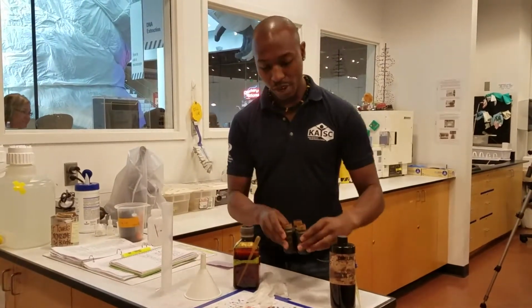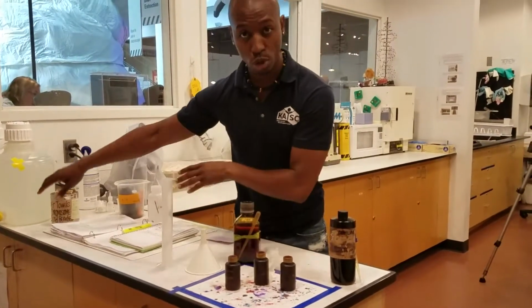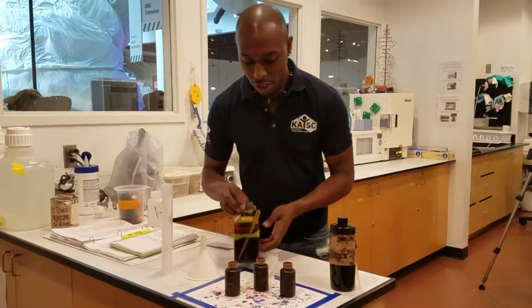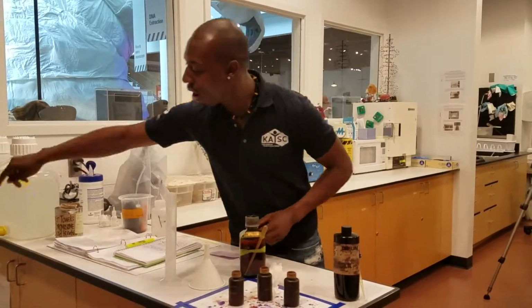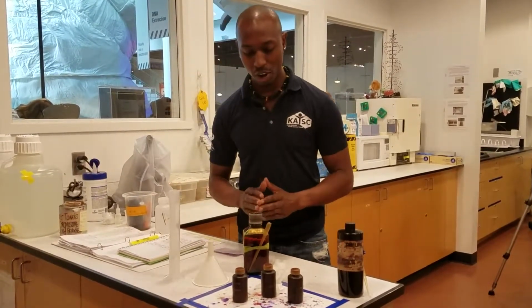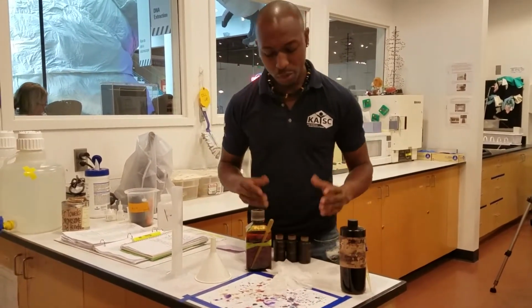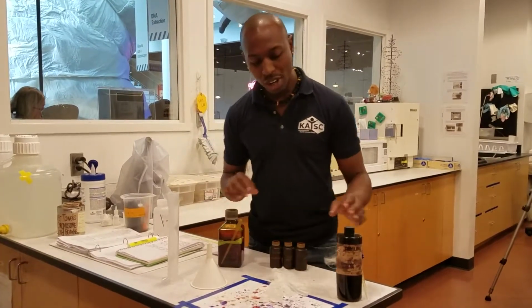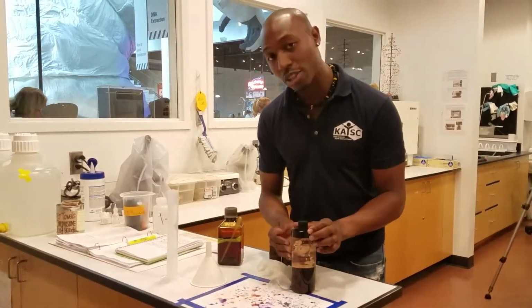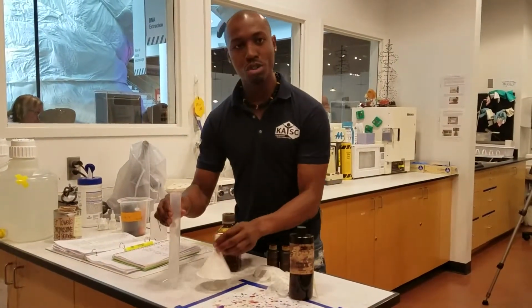These 3 bottles right here are already diluted. They're also located in cabinet 1. This Lugols iodine is also already diluted. It is also located in cabinet 1, all right? Now, when you're looking at these bottles and you're like, what are they? Well, they're still 10% Lugols iodine. The same for this. Now, we're going to actually dilute the actual 100% solution into 10% Lugols iodine.